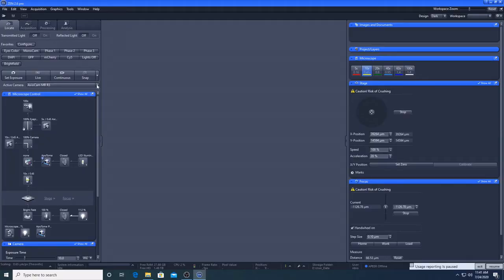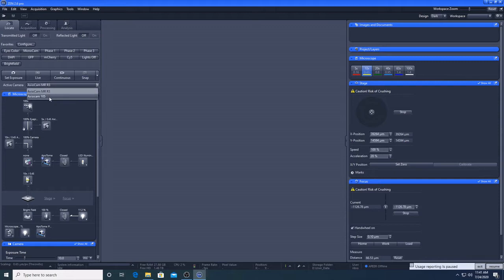The camera can be changed here. This is the colour camera for bright field imaging, Axiocam 105. This is the black and white camera for fluorescent imaging, the Axiocam MRR3.